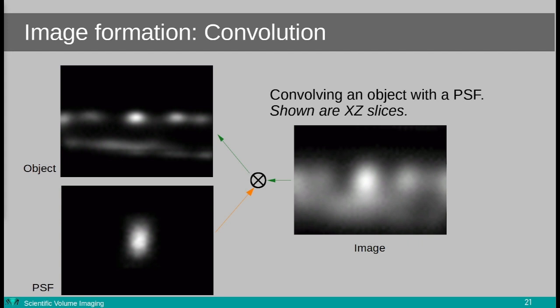The sum of all the intensities in the PSF image is 1. So every pixel in this image has to have a value between 0 and 1. This is done so that the convolution and deconvolution operations obey conservation of total energy. This does mean, however, that a PSF image cannot be represented with whole numbers or integer values.